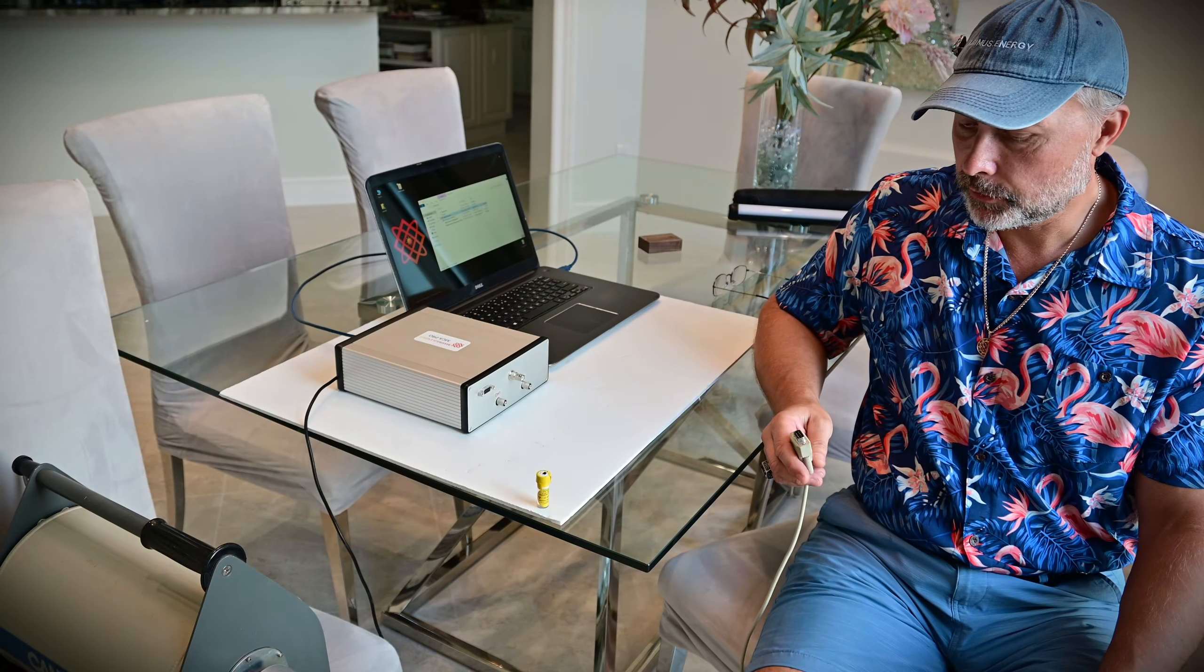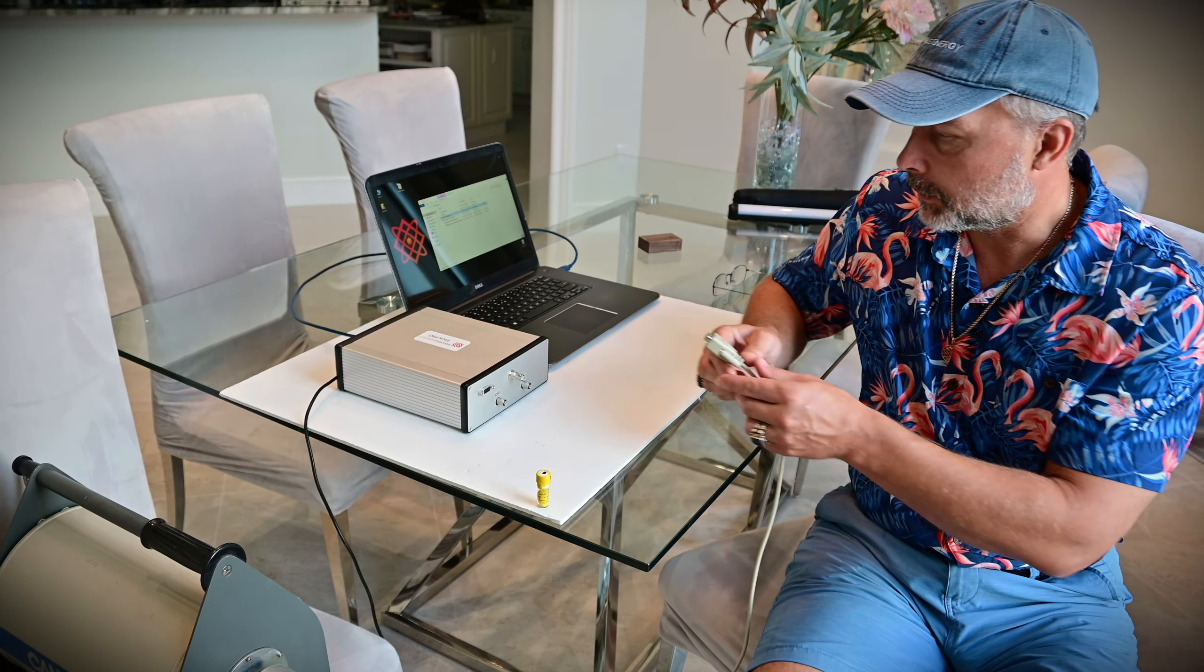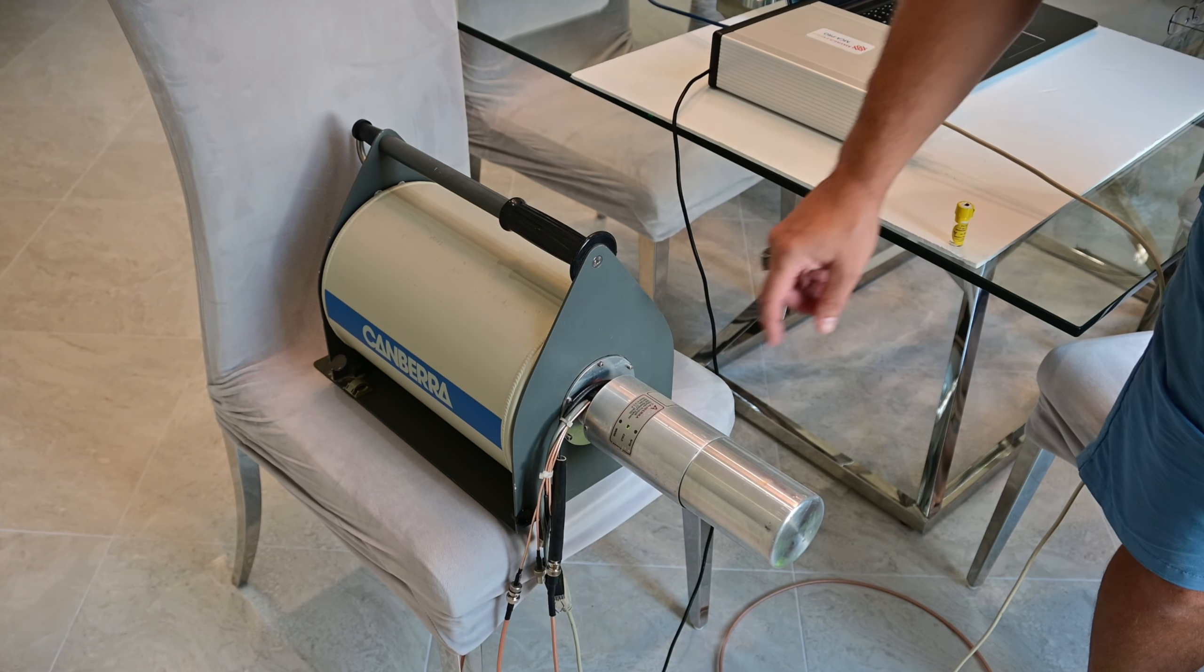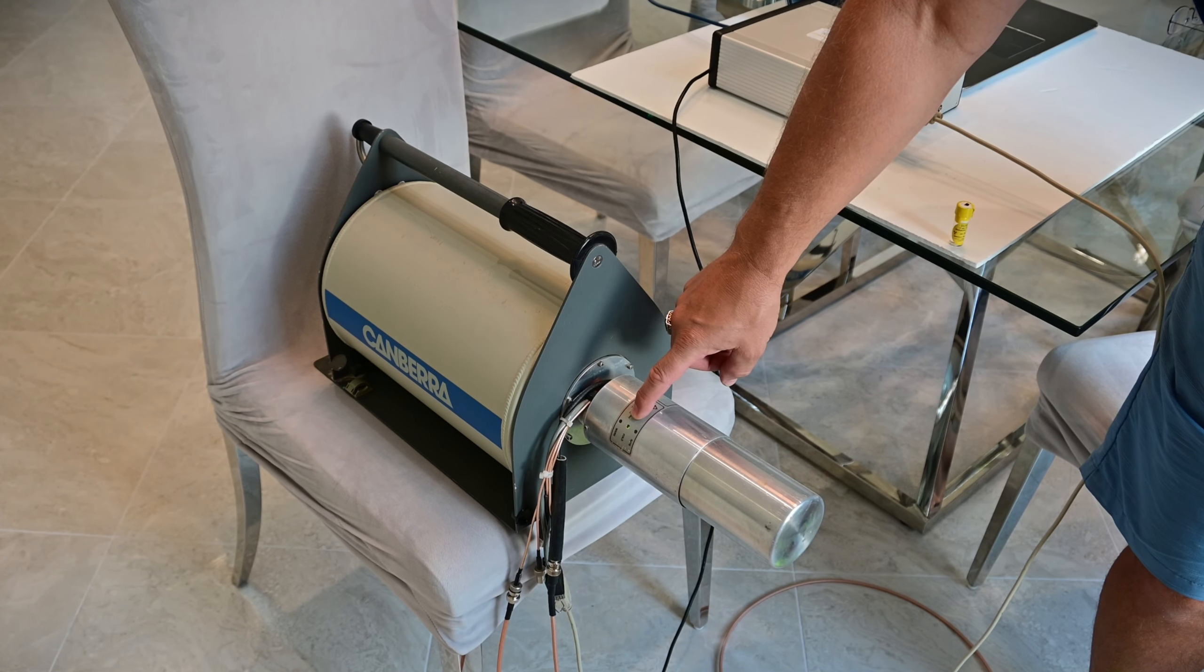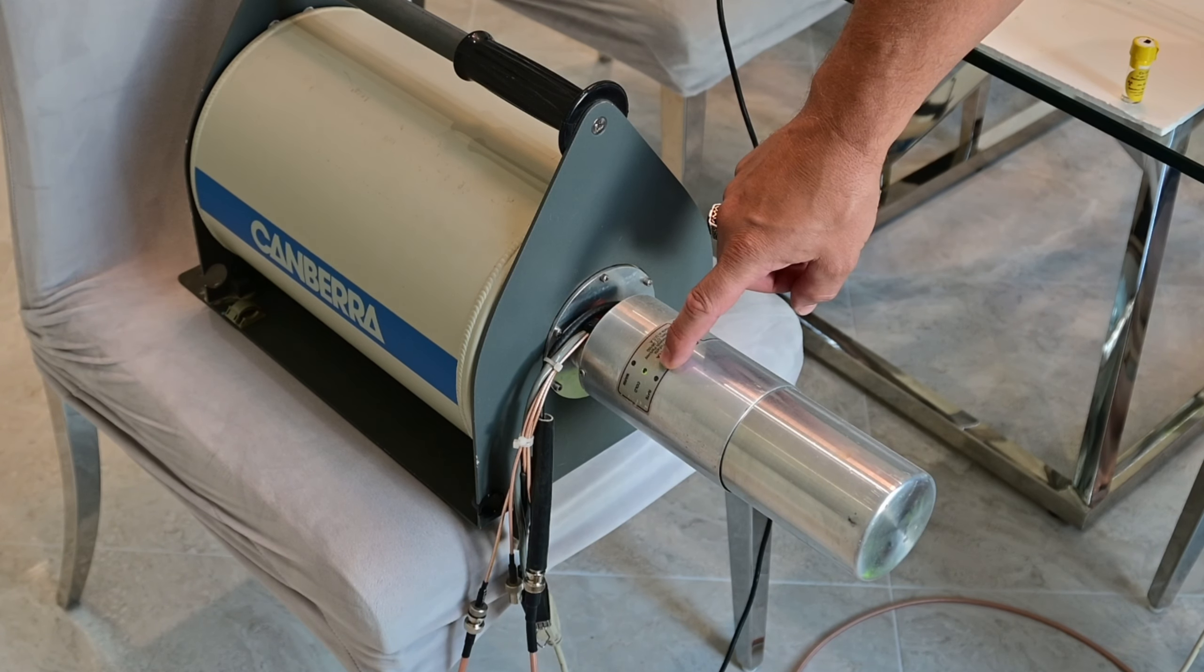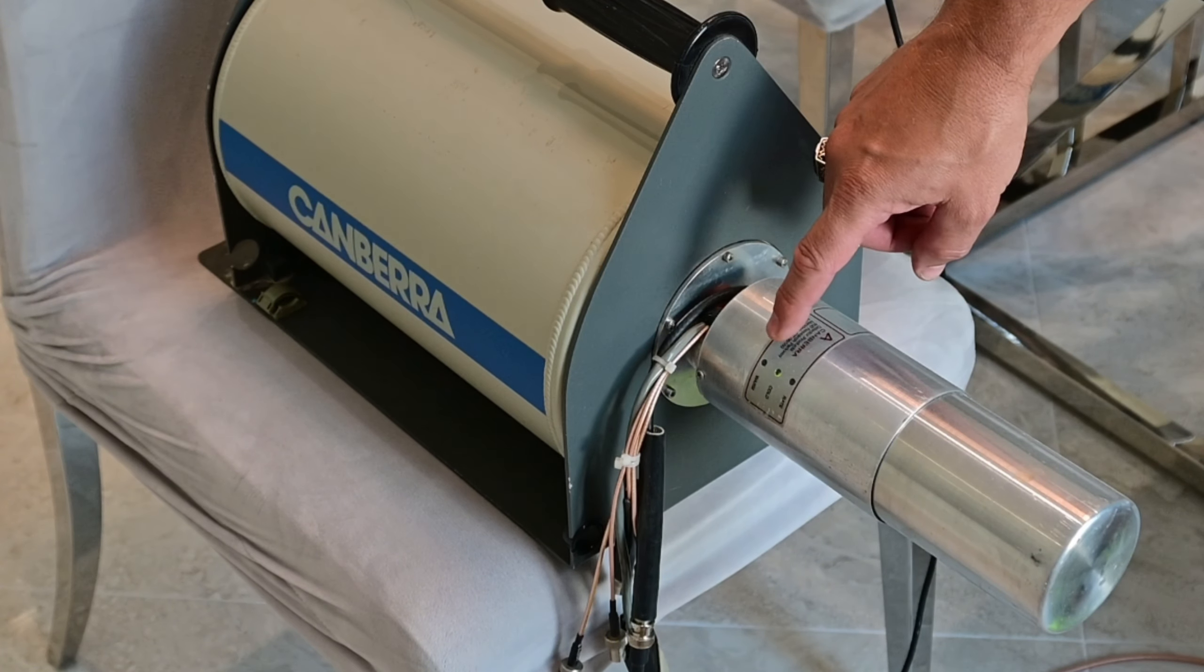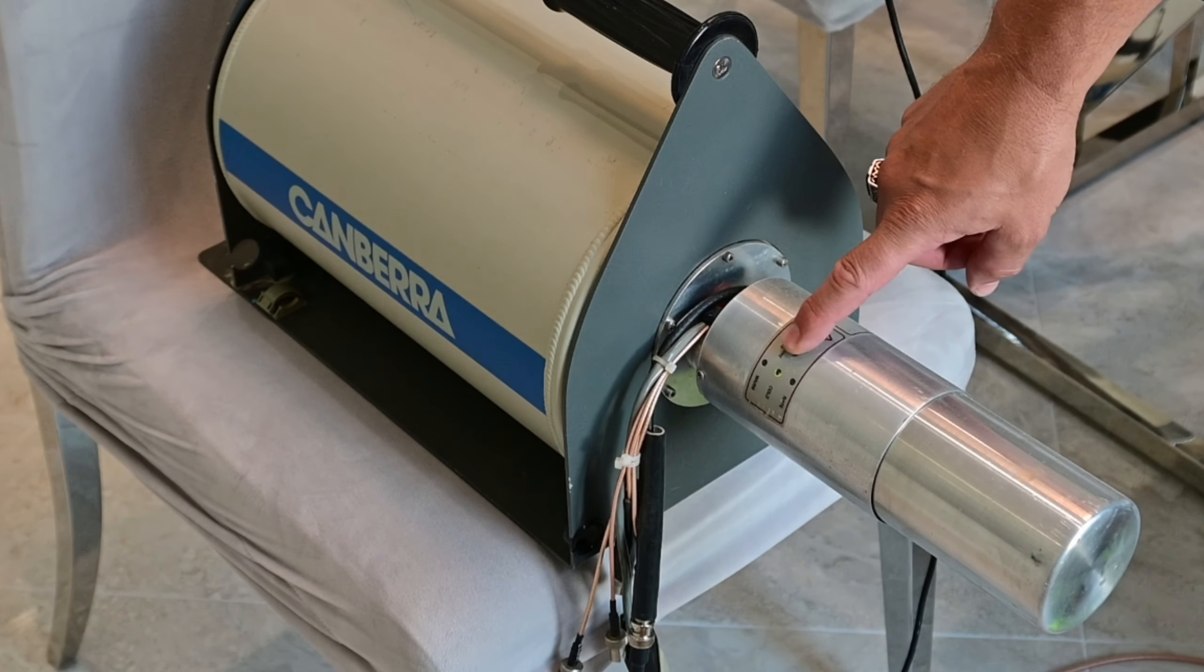Once the detector is cool, the first thing you do is plug the pre-amp power supply from the detector into the MCA Pro. If the detector is cool, the green cold LED light on the detector will be illuminated. If the detector is warm, the warm light will be on, then you'll need to wait some more, or maybe you'll need to add additional liquid nitrogen to your detector. The green cold light must be on, it means that the detector is ready for operation.